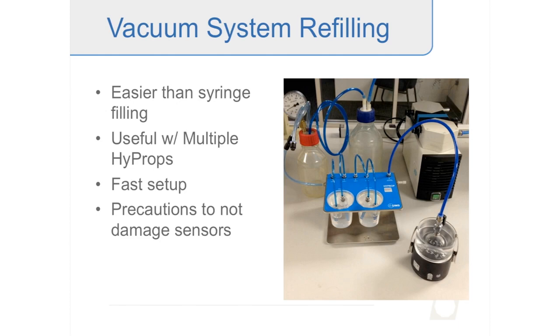Some precautions when using a vacuum system: you don't want too powerful a vacuum, because the pressure transducers in the HyProp are sensitive and can be damaged. I've seen cases where strong vacuum systems easily damaged the pressure sensors. The vacuum system we use takes about 30 to 45 seconds, maybe a minute, to achieve full vacuum. If it can achieve full vacuum faster than that, be careful.